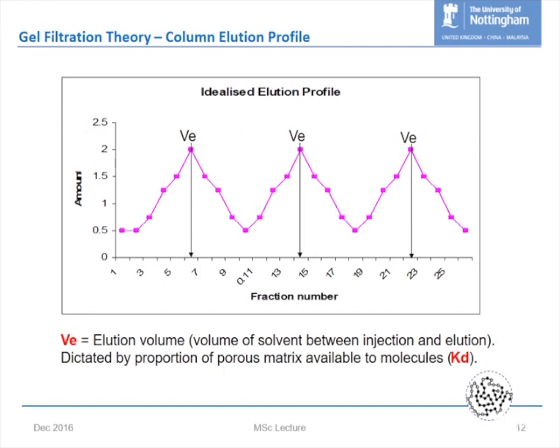Okay, so what I've got here is just a slight sidetrack. We're still talking about the elution volume, but this is, as it says on the scheme, idealized data. Everything we've said to you so far assumes we have a physical detector at the end of the column, which determines the amount of material coming out of the column.